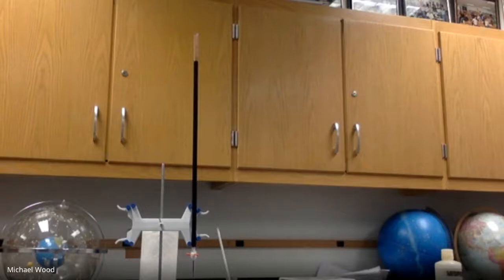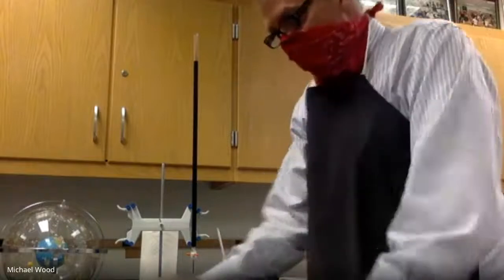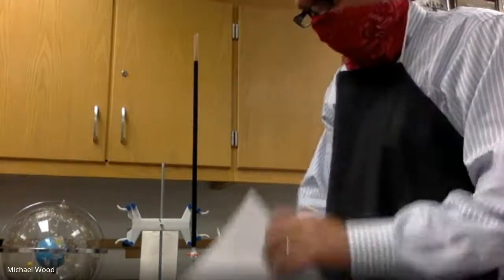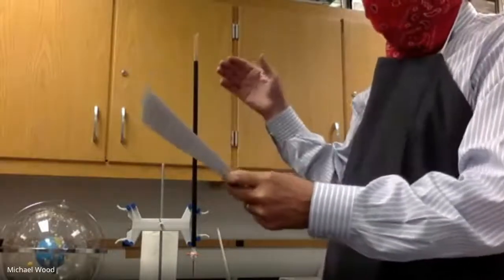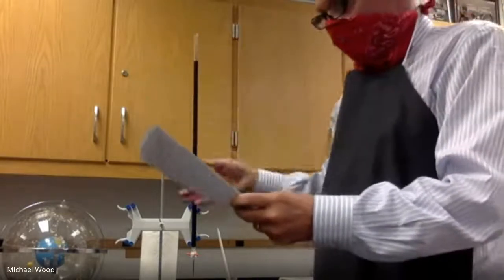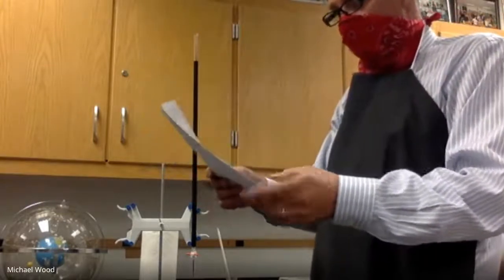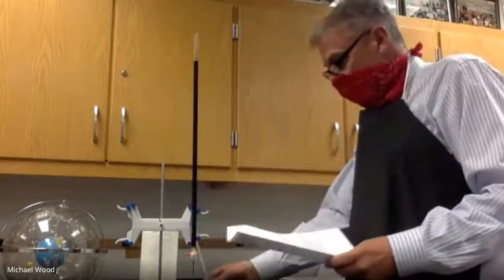Part of the chemistry here I'm going to talk about next week. But what I'm going to do then is take this and read the procedure. I've already done step 3, I rinsed it with distilled water. I've added the KMnO4. I just did that. I did step 7, and I did the oxalic acid.